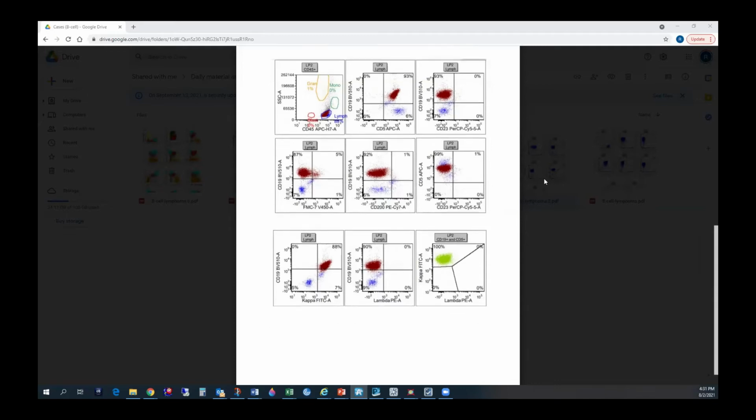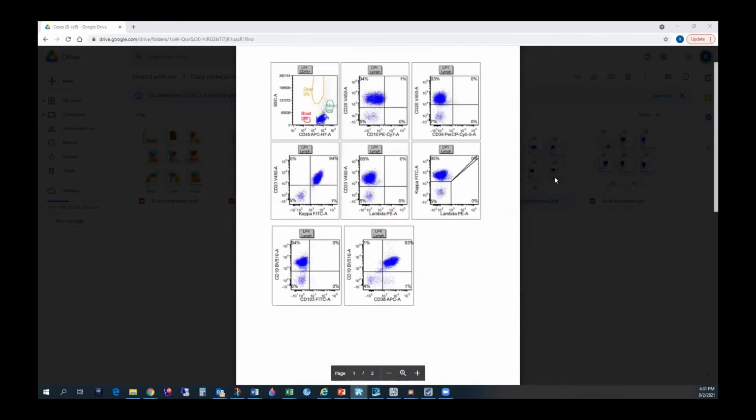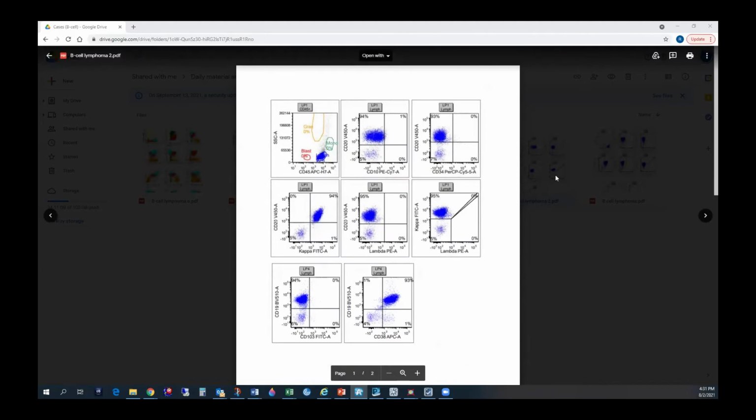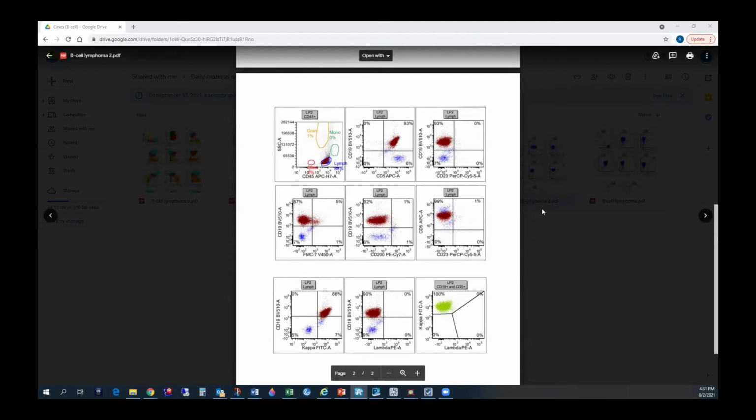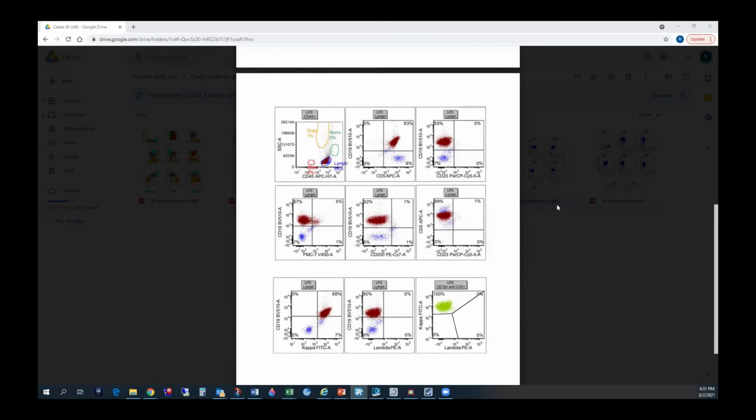How will you report it, Akash? I would call it a, how should I say, can I just not call it mantle cell and rather just call it a B cell, a low grade B cell neoplasm? It's not low grade. I cannot say it unless I have Ki67. So what would maybe be your B cell line?